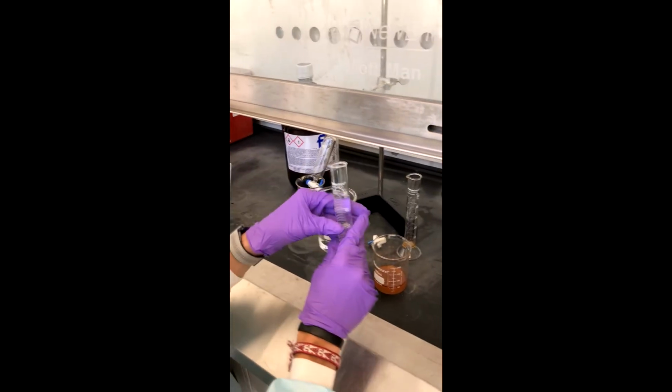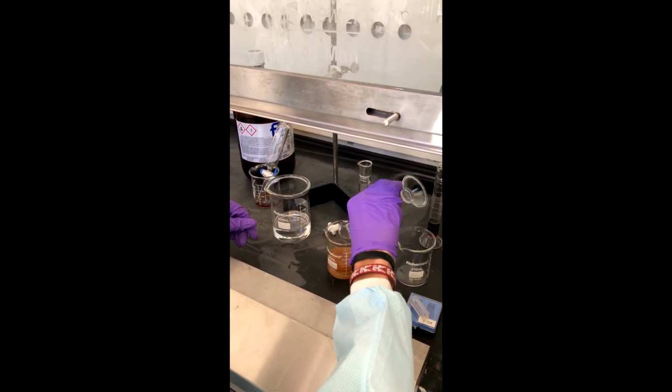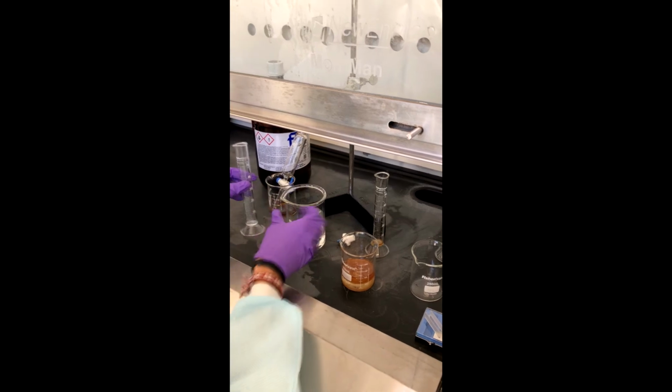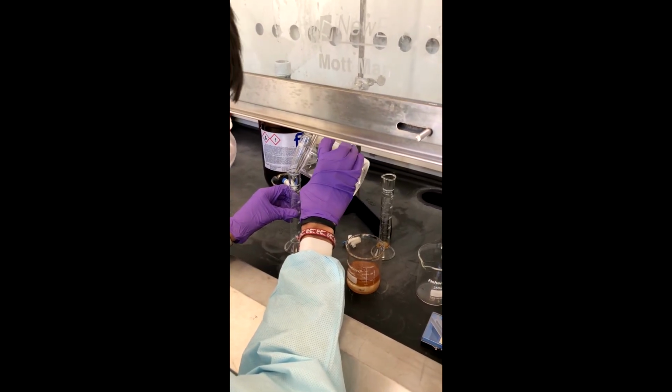One thing to note is that many times the dichloromethane with caffeine in it needs to be heavily diluted before it can actually get an appropriate reading, due to the max reading on the spectrophotometer being 3 and it being above that.